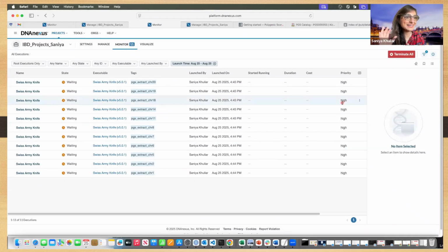Sorry, I mean for these 11 chromosomes. There are 11 chromosomes, so half of them are found here.